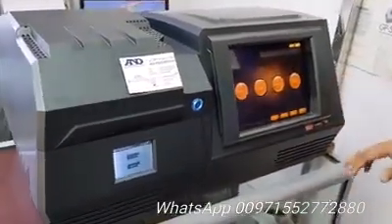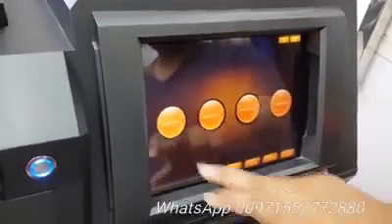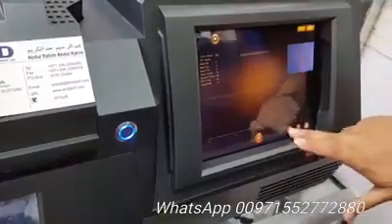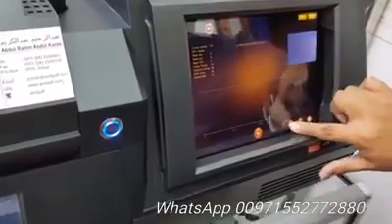After this, we have our hair calibration, peak adjustment, and repeat test. But what we need right now is a single test. Just select gold because we are going to test the gold — the gold is AU.